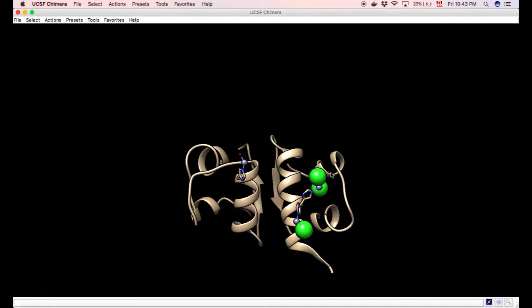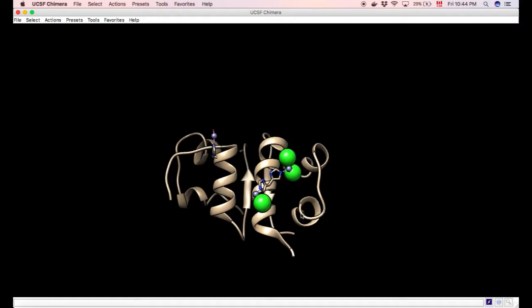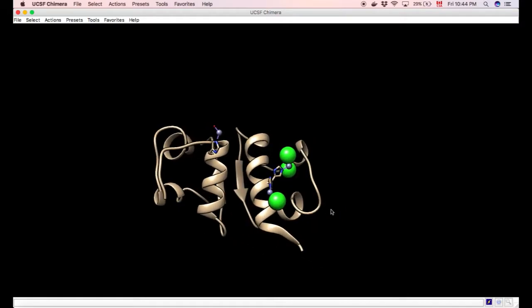Right away, just before we keep on going, you'll see that sometimes when you open up protein structures, you don't just have the ions or just the main backbone, but sometimes you have key amino acids showing. Usually these are amino acids highlighted to show that they're actually interacting in a particular way. Usually there's a lot of interaction, but interaction with something outside, let's say a ligand or an ion, can be shown sometimes to highlight something maybe special about the protein.